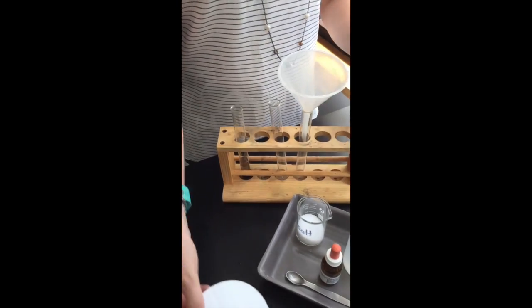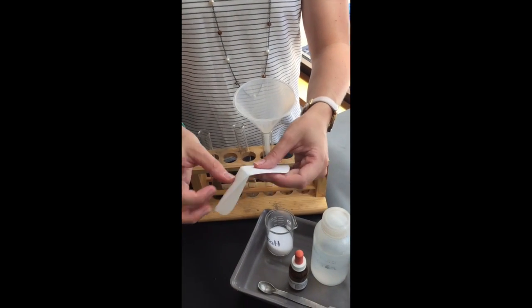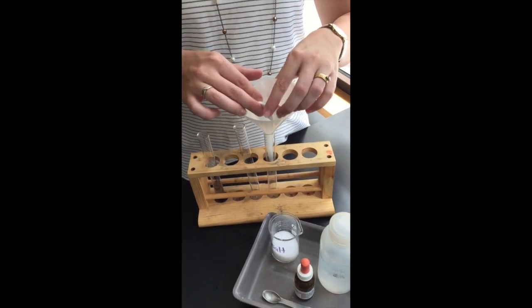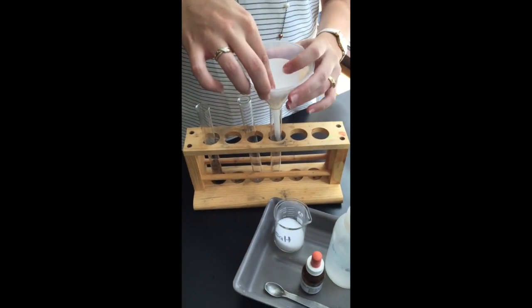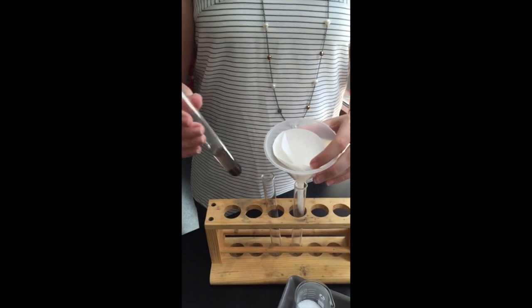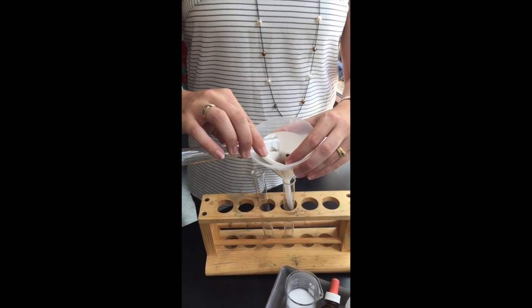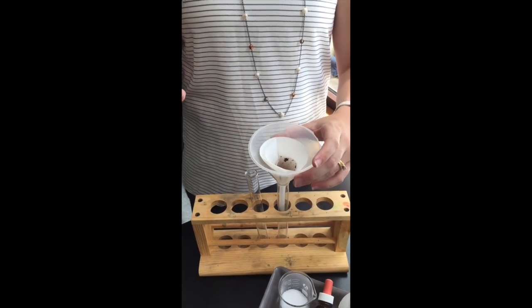Then get your filter funnel and filter paper, and fold your filter paper accordingly to filter out the mixture. The part we want to keep is the water that comes through that's been mixed with the soil, but not the actual soil particles.